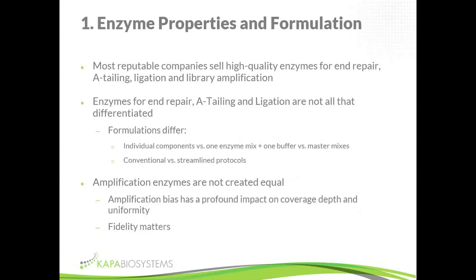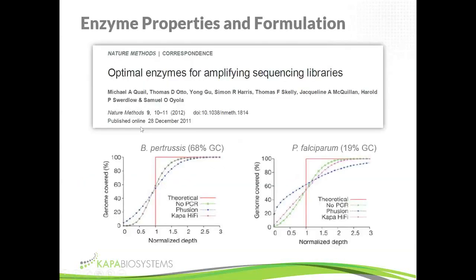And so on the point of enzymes, I just wanted to make you aware of this. In 2012, the beginning of 2012, Mike Quail's group at the Wellcome Trust Sanger Institute in Cambridge in the UK published a paper in Nature. They looked at the enzymes that were available and could be used for library construction, compared them all in terms of amplification bias, and identified Kapa HiFi.